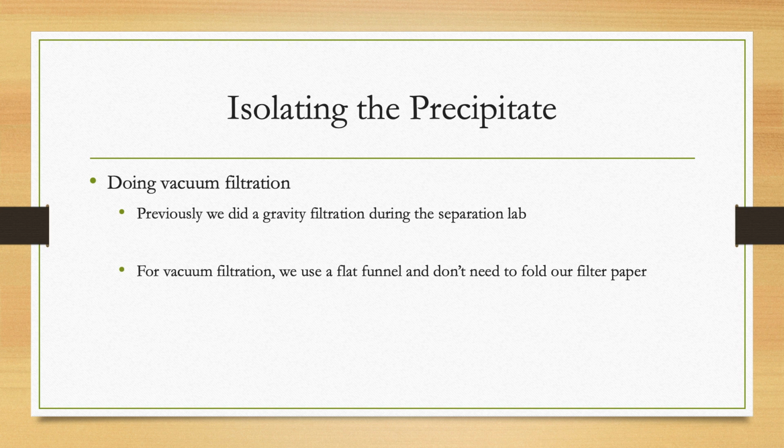All you need is a piece of filter paper. It's small and round, and you can mass it out ahead of time. You put that little filter paper on the Buchner funnel, and it should fit really flush and nice. Then you turn on your vacuum. You'll hear the hissing of air getting pulled through everything, and then you can just do your filtration. It's fairly fast.